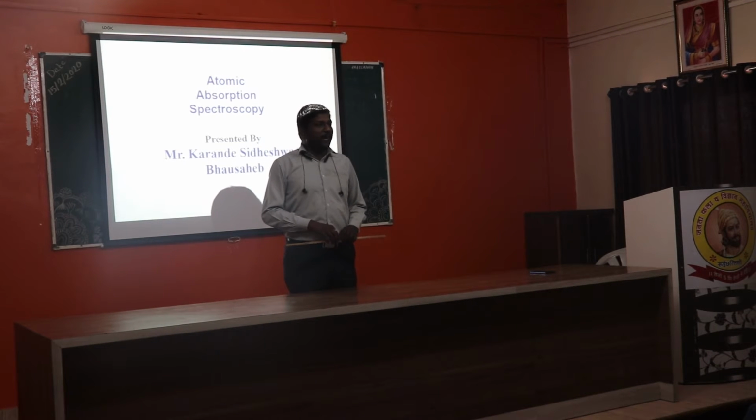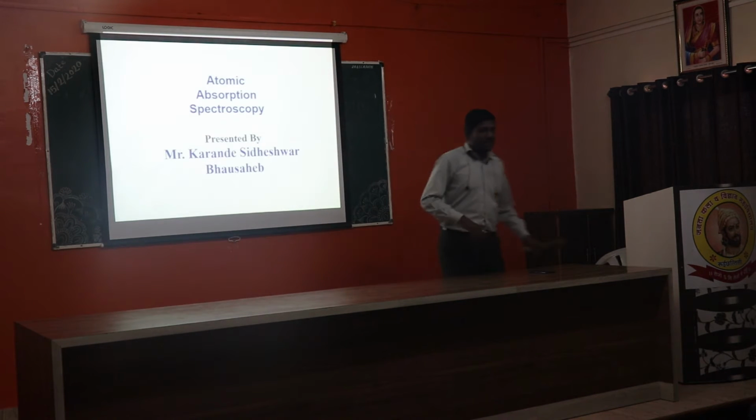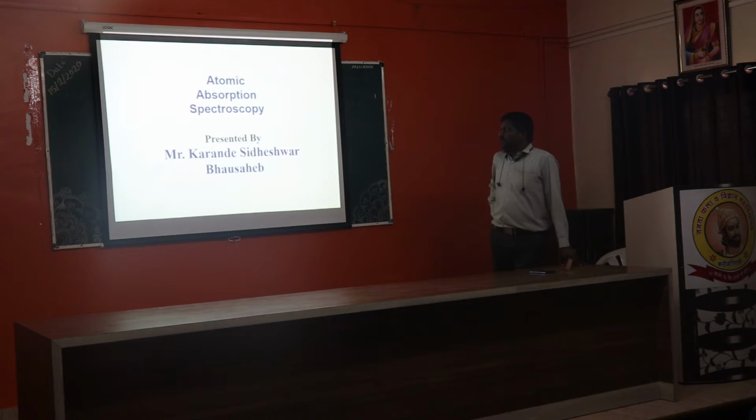It is a branch of spectroscopy which gives us information about atomic absorption. So atomic absorption spectroscopy, today we are going to discuss this topic. Next slide.